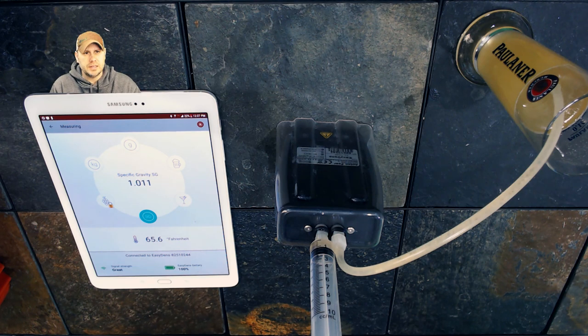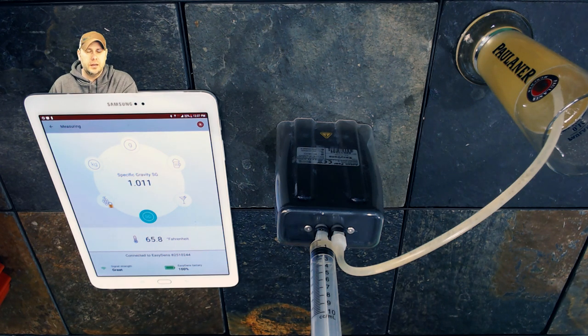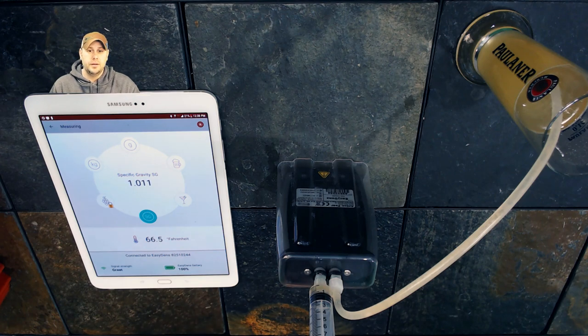This works on Android and Apple — they have apps for both. I actually have this feeding into my brewing system, so I never use my tablet separately; a reading logs directly and automatically into my brewing system, where it gets charted across the beer. I use Tilts for fermentation data and mass flow sensors on the hot side, then the Anton Paar for finished beer — so I can track a beer from inception all the way to finished, with time frames, dates, temperatures, and gravity points all in one place.